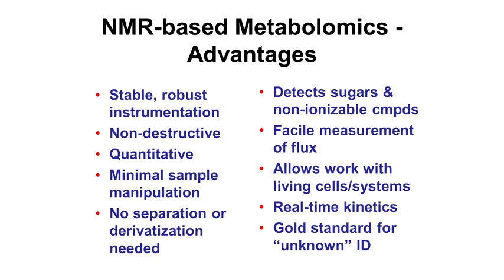The typical lifespan for an NMR is about 20 years, and there's very little downtime. The magnets are stable, the technology is stable, the computers are stable. The only thing that might burn out over time are probes. Compared to mass spec, often if things go down once every month or two, you're considered lucky.